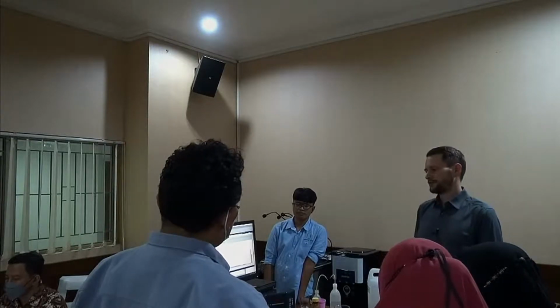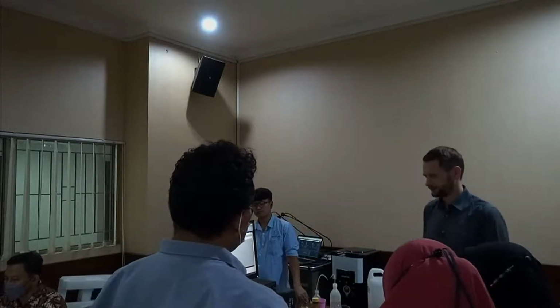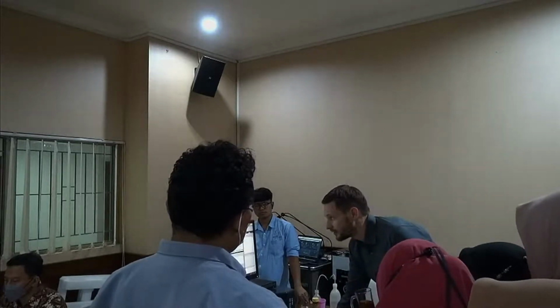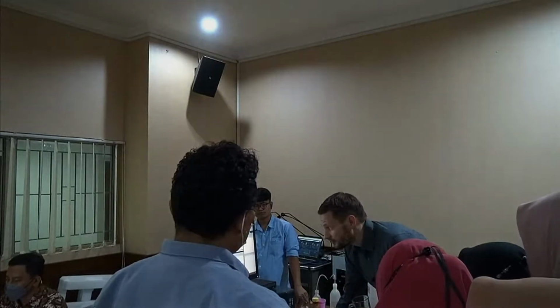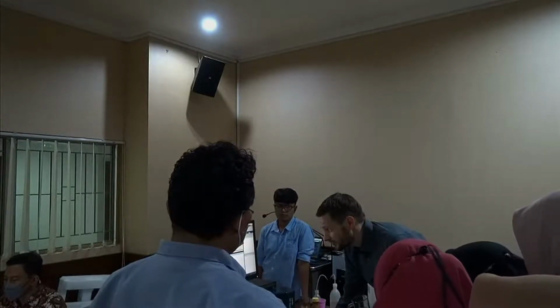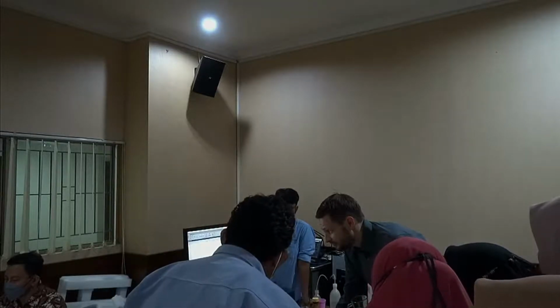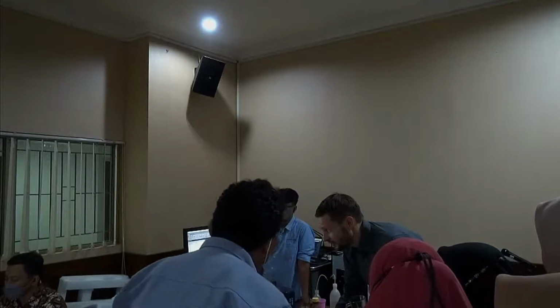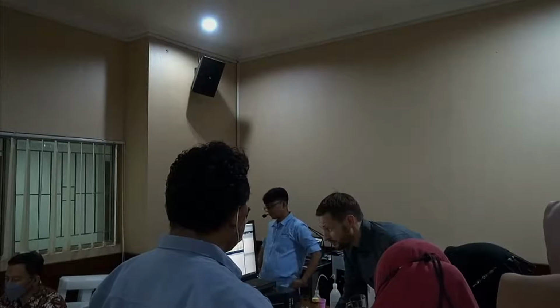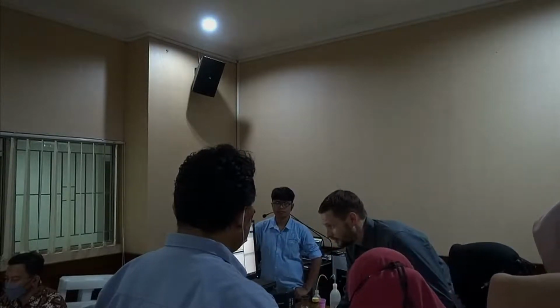Actually, the first 3 measurements we made were at 50% ultrasonic, so you can already, in the meantime, have a look at results. First difference we see without ultrasonic, it's more coarse. So these are the measurements now without ultrasonic compared to the 3 measurements here with ultrasonic. First hint would be ultrasonic has an effect, but let's wait on the next set of 2 measurements to really confirm this is the case.